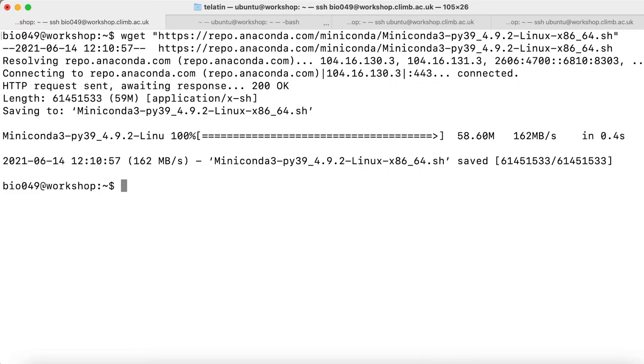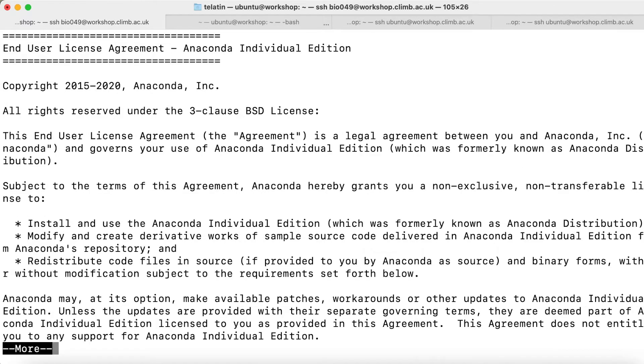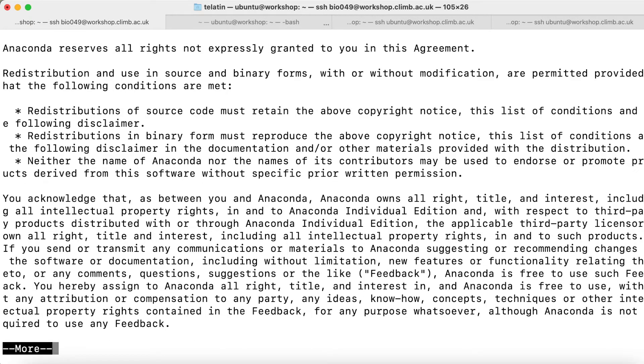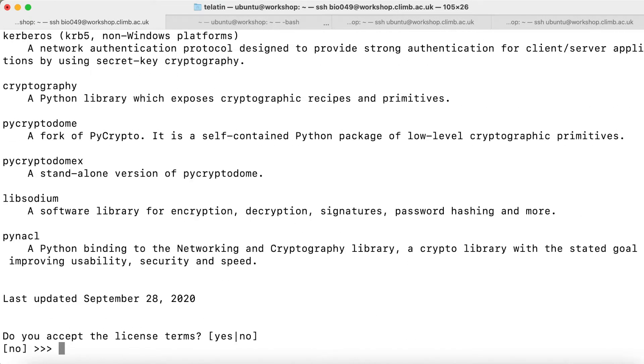Now it's just a matter of bash miniconda. The first question is please review the license, press enter to continue. I hit enter and then page down until I reach the end, and then I can accept with yes.